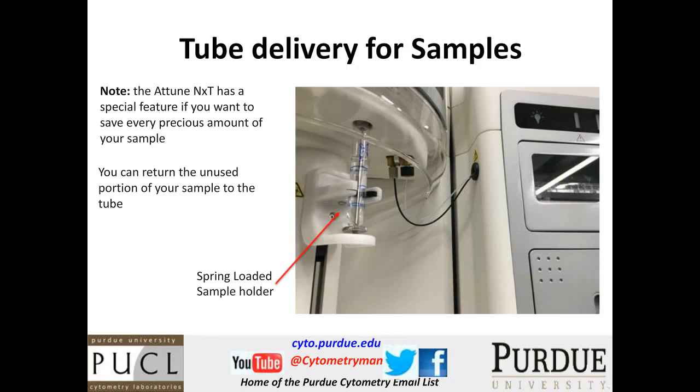It's a spring-loaded system. It pops up, and the sample collection tube is in the center of the tube and does what most systems do. It just sucks the sample up into a loop, and you're good to go.